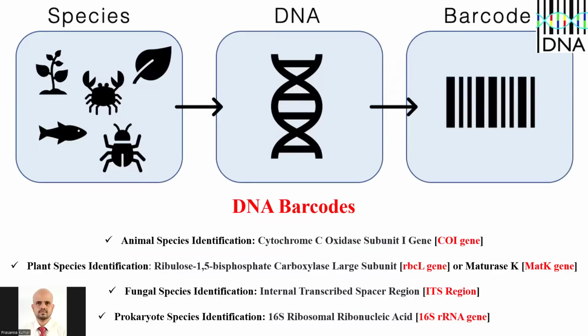So the DNA barcoding effort is all about identifying the biological system. Here is a species. You go for sequencing, you deposit the barcode in the database. The entire DNA sequencing or barcoding works in this way. You sample a specimen, sequence the barcode gene, compare it with the database, and you will know what it is.